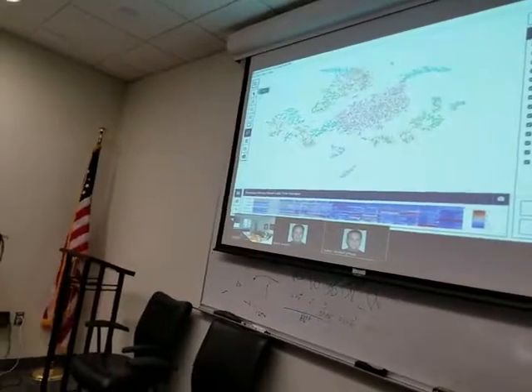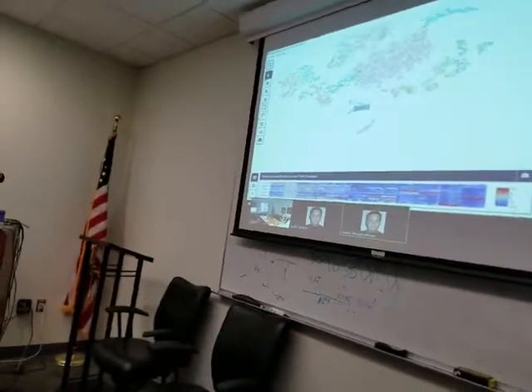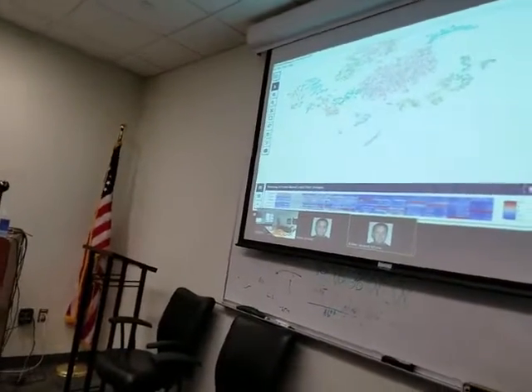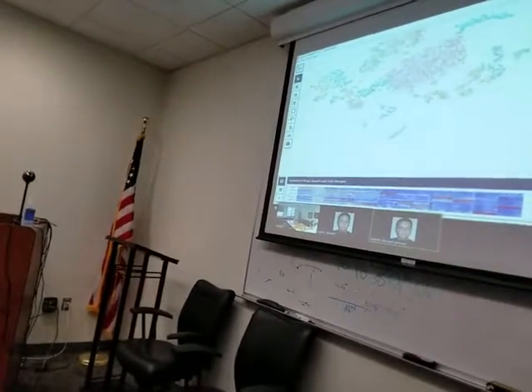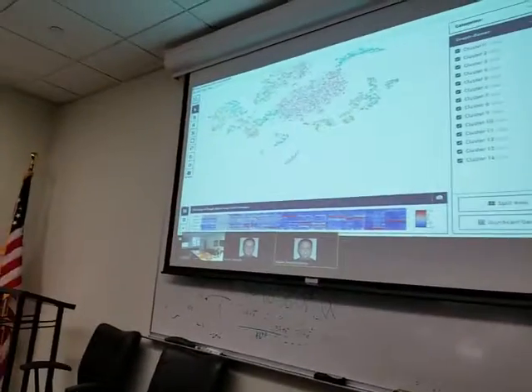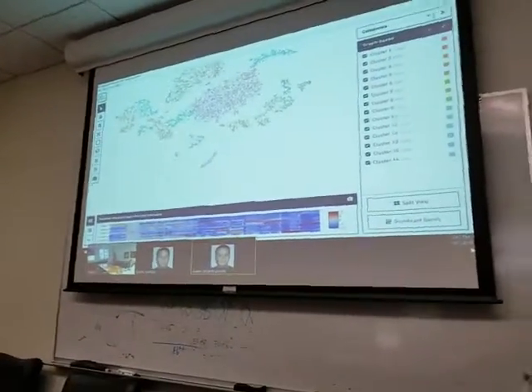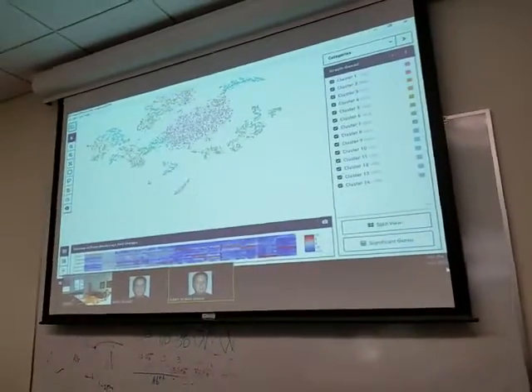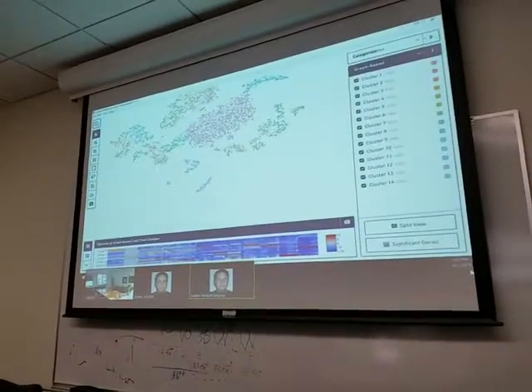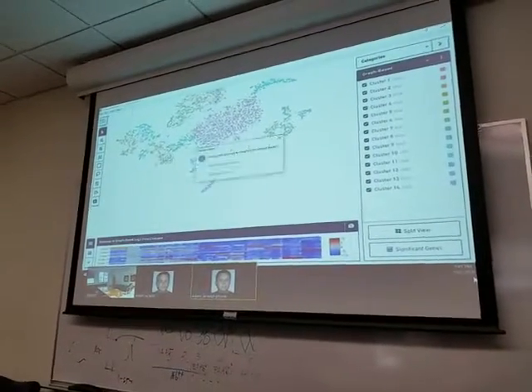Well, okay, put it another way. If we started over again with Cell Ranger, and now we're just looking at that, let's say that's the IL-4 receptor positive ones. Then we get that for one person, get it for another person, and then we can start over again and concatenate those two. Now we've got the IL-4 receptor positive or some subpopulation of one and the similar one in the other, and then see how those are different. If we went back to Cell Ranger and did it again, then we would not be comparing apples and oranges to apples and oranges. We'd just be comparing the apple to an.